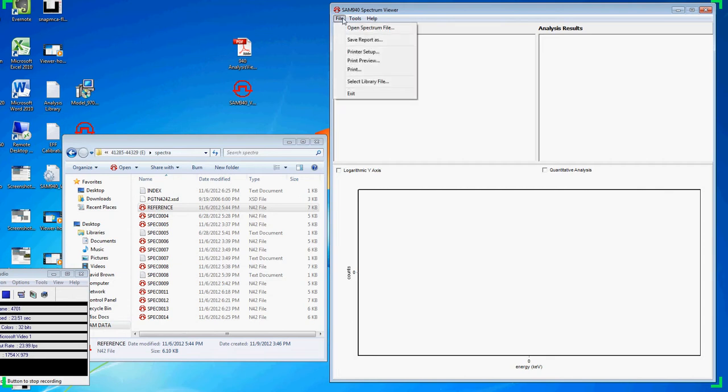The Word version may be modified as needed with notes or headings and then saved as a PDF or archived for future reference.